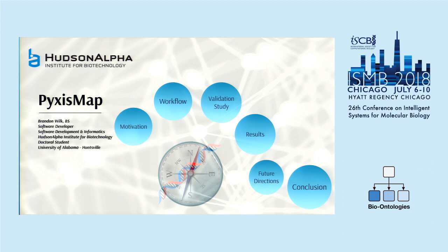I'm going to talk to you about our tool PyxisMap, which leverages the powers of the HPO ontology to help us prioritize variants based off of a patient's phenotype.